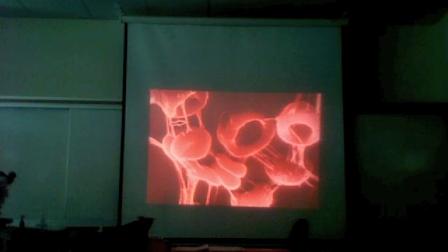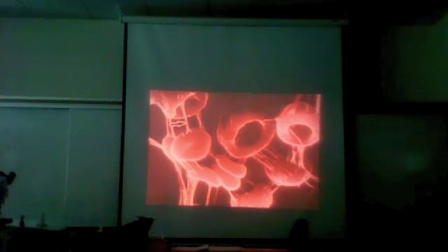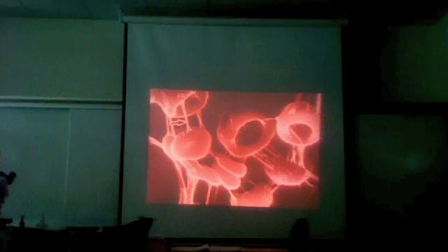What? A bunch of erythrocytes and a bunch of fibers, so blood clotting. These are platelets here. And these are the erythrocytes that have that indentation in them.